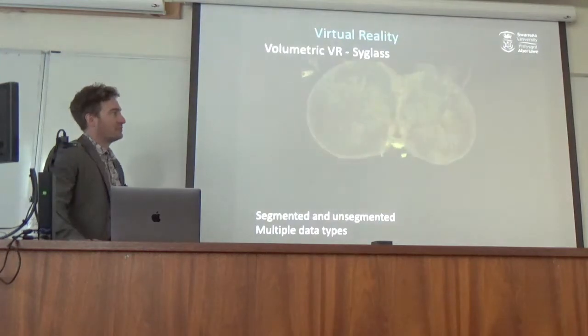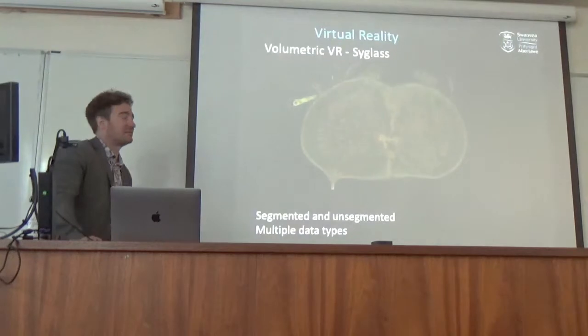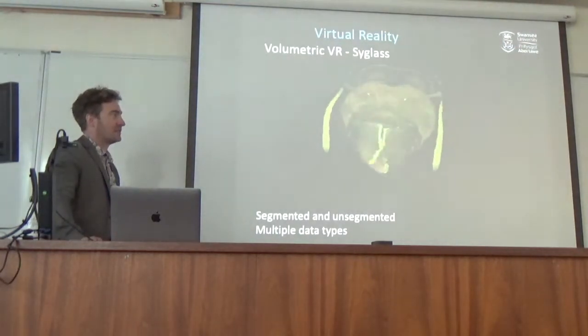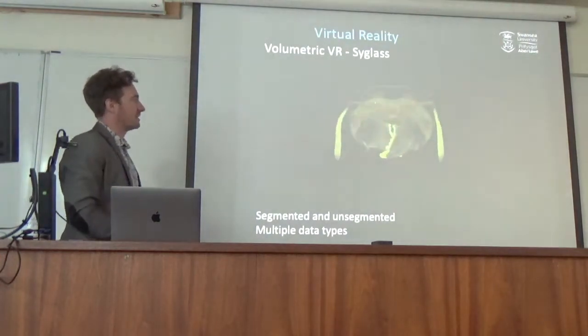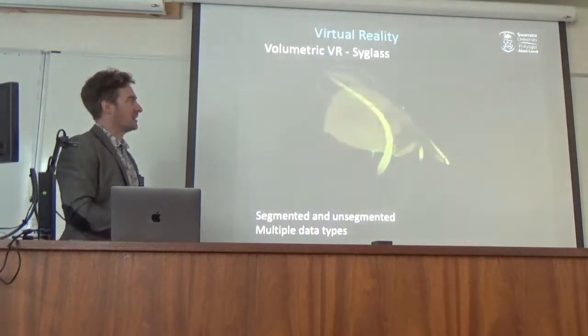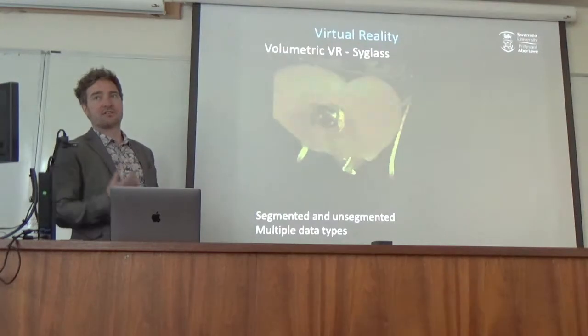We're actually able to look at those 3D structures in VR. It's nothing different to what we've been looking at on the screen, but how we engage with the data is hugely different. The user experience for us, as people who are looking for things in those structures, has changed massively. This is that ant head, a video that I created within that software as well.